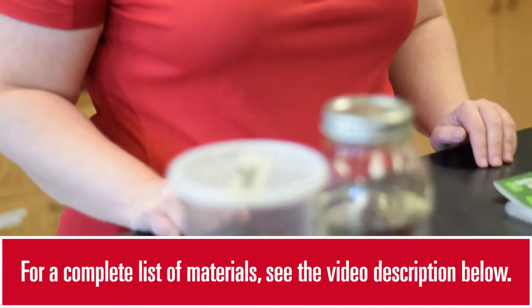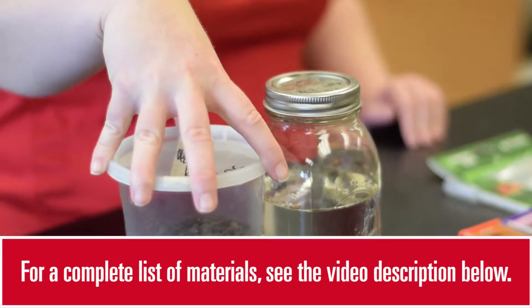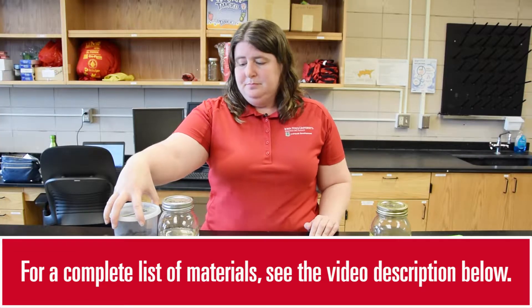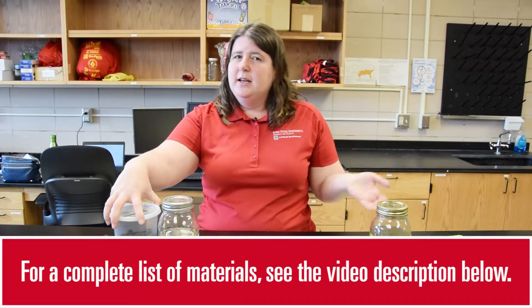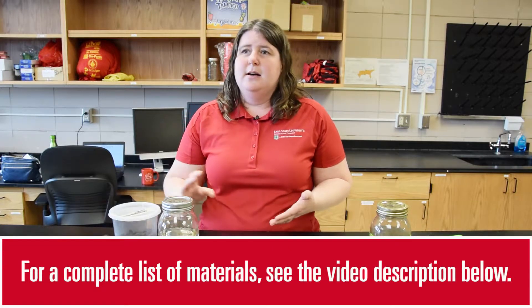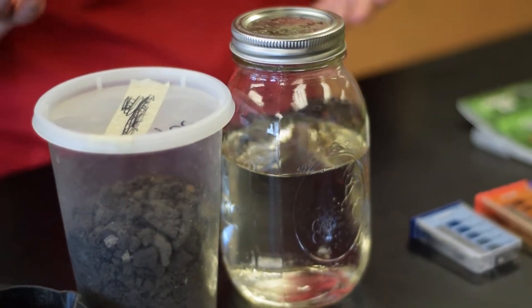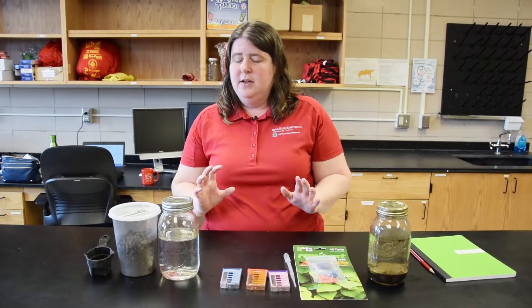For this experiment, you'll need a few different samples of soil. It's nice to have a variety of soils to test so students have something to compare. This could be soil from a field, soil from a garden, soil from a wooded area or a prairie or some other natural area, or soil from different types of fields with different crops or different management.